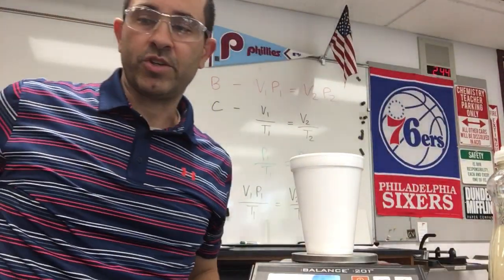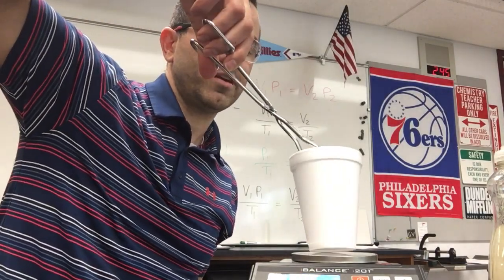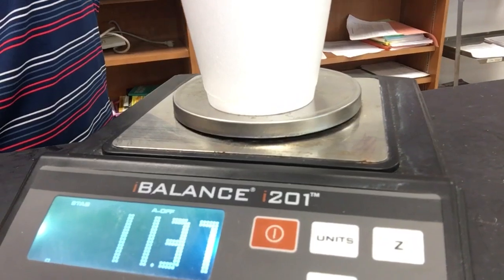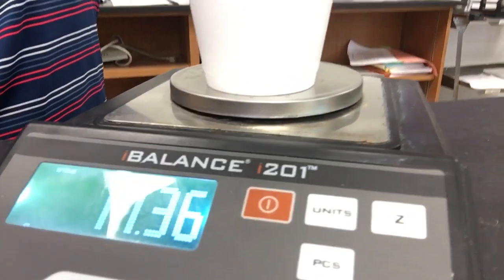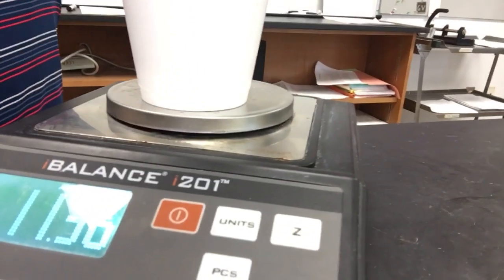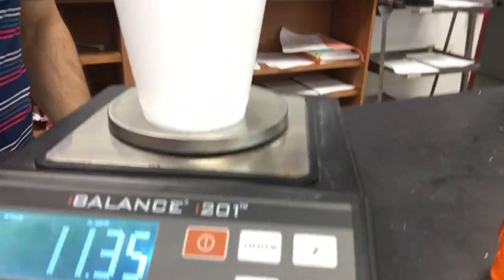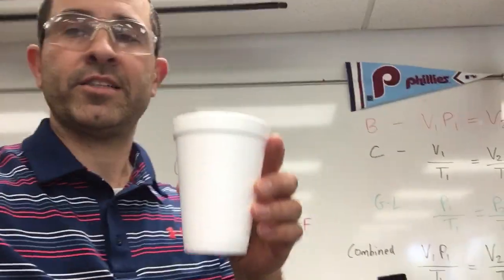The next step: I want to take my piece of dry ice, use the tongs so I don't get frostbite on my hands, put it into the cup, and let's check out what the reading is. 11.37. Oh, 11.36. What's going on here? It changed. Oh no, 11.35. The solid is turning into a gas — it's getting lighter as we speak, so we've got to hurry up. Write down 11.35 grams. Dry ice weighs 11.35 grams.